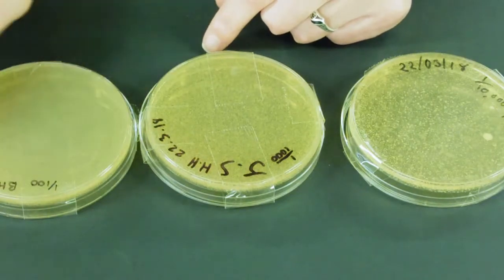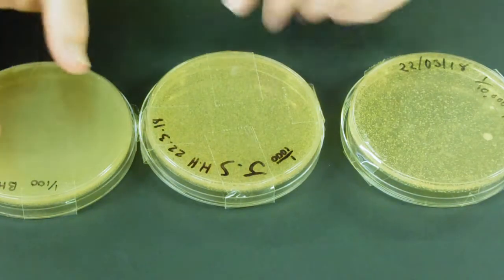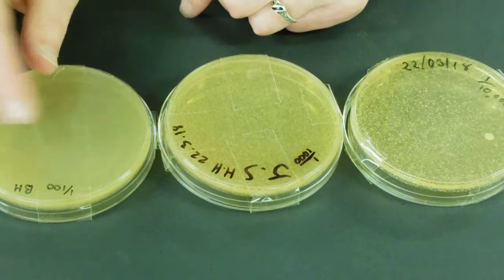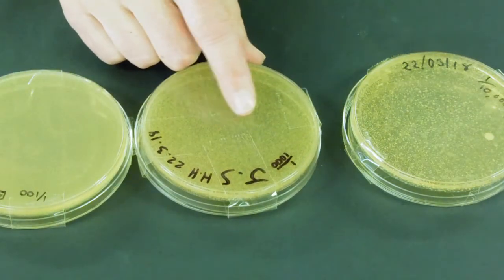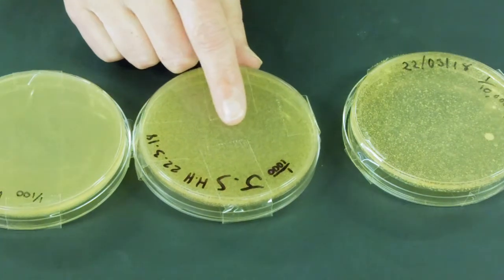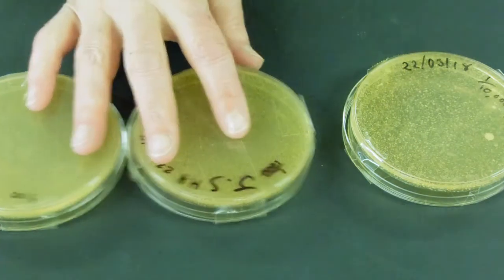So, our one in a hundred, hardly any gaps, still quite a lot of overlap, so we couldn't count this because of the overlapping colonies. Similarly here, our colonies are very close together, some of them are overlapping, we're not going to be able to count those either.